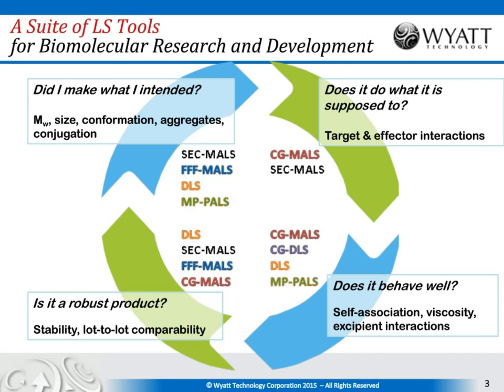Does it do what it's supposed to do? Does it have the proper interactions with a target or with an effector? Is it a well-behaved molecule? So how does it self-associate? Does it become viscous when you use it at high concentrations? How does it interact with any excipients in the formulations? And finally, is it a robust product? Is it stable? Can you make it regularly lot to lot and come up with the same properties?